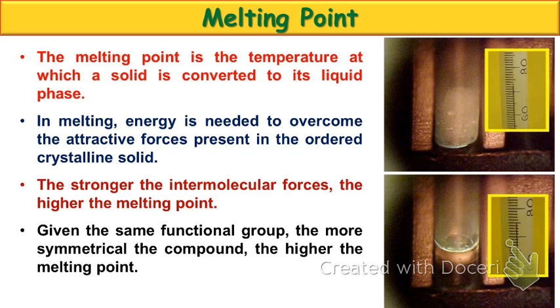If you take a look at the right, we've got two pictures. That top one is very, very close to the melting point. How might you tell that that's close to the melting point? So it's still a solid, so it definitely hasn't melted yet. What else? If you look really closely at that image, you kind of see some weird pseudo-reflections. That's the molecule sweating. So it's starting to transition into a liquid, but it hasn't officially started yet. So when we're looking for a melting point, we're looking for that phase, and now we're really close. The first drop of liquid we see in that capillary is now the beginning of our melting point.